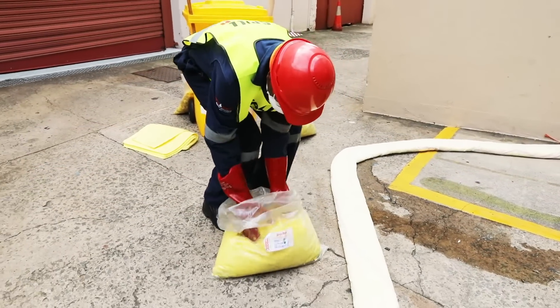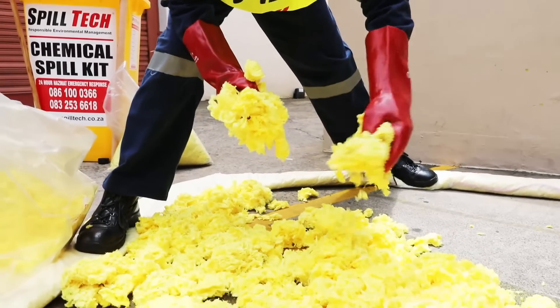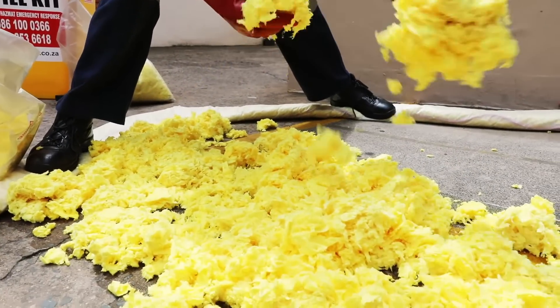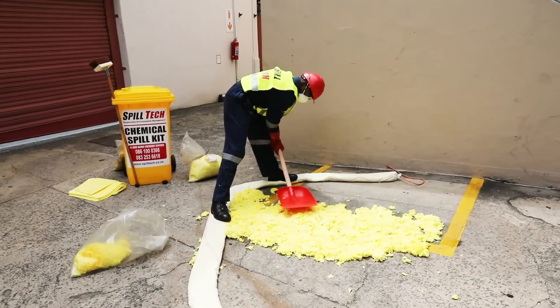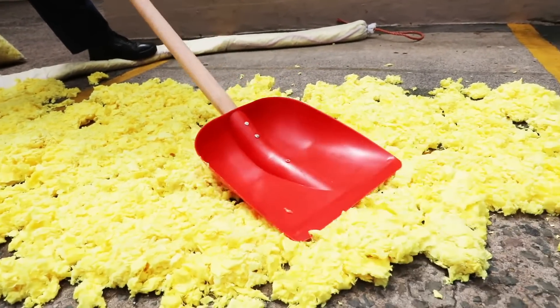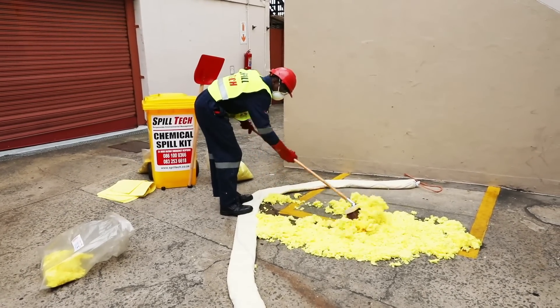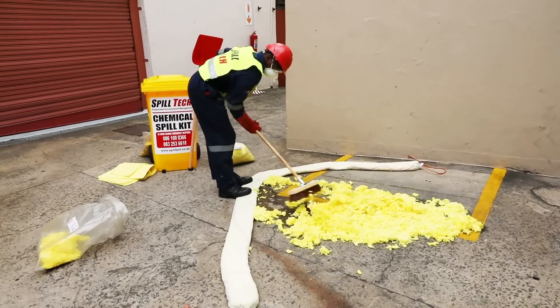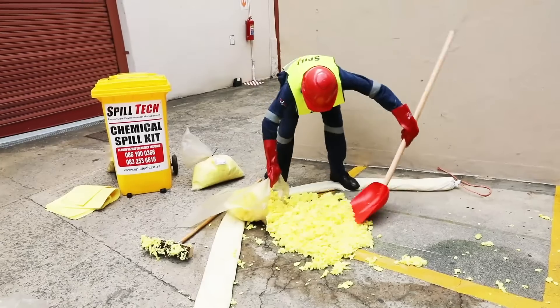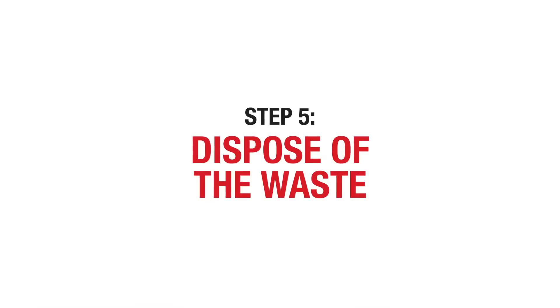Apply a layer of scatter over the spill to effectively cover it. The scatter will change color as it absorbs the liquid spill. If there is liquid remaining, add additional scatter to the area and tap it down with the spade to help absorption. Sweep up the waste residue using the spark-proof broom. Make sure to sweep away from yourself at all times, as the waste residue is still hazardous and you must take care not to sweep any onto yourself.